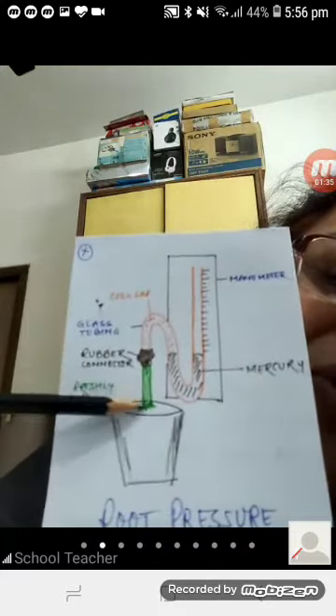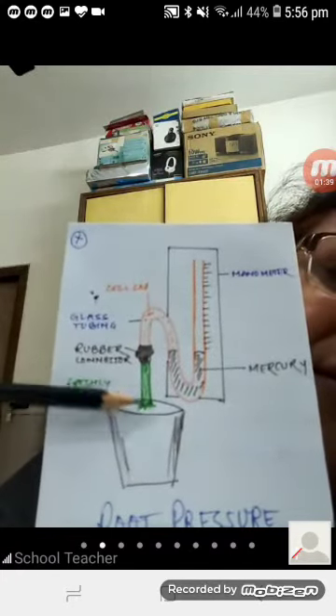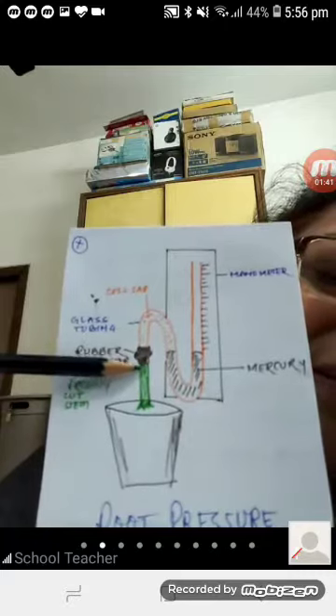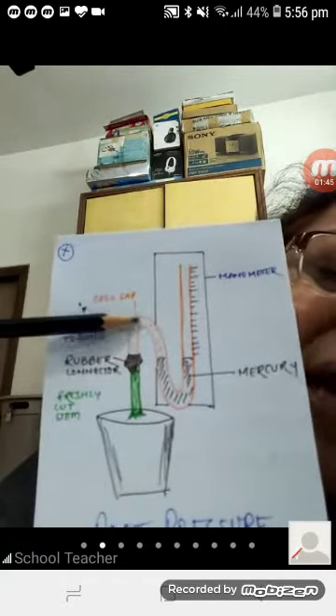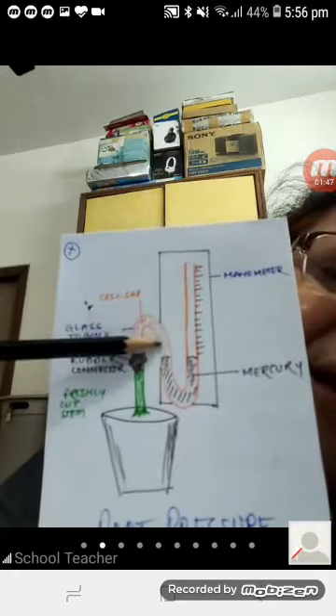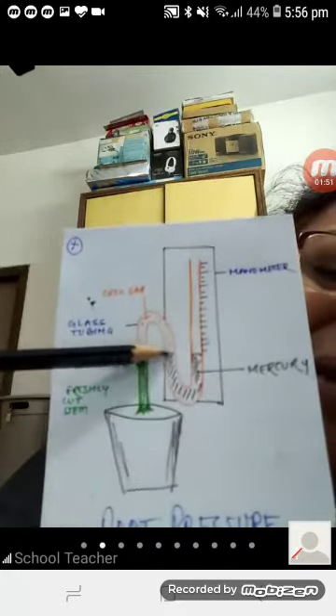The root of this plant is still absorbing water, so cell sap will ooze out. At the beginning of the experiment you can see the level of mercury in the manometer.